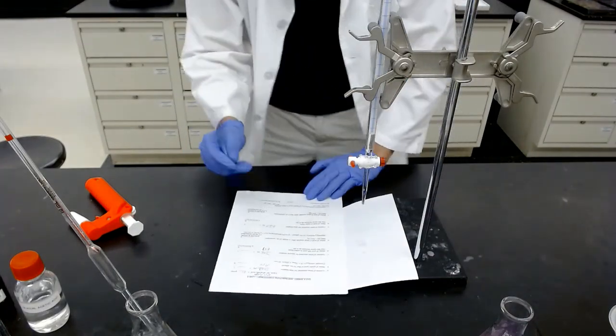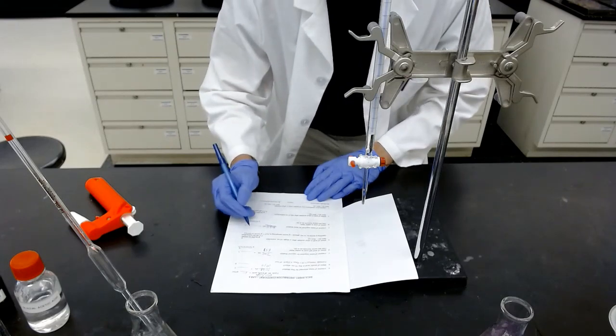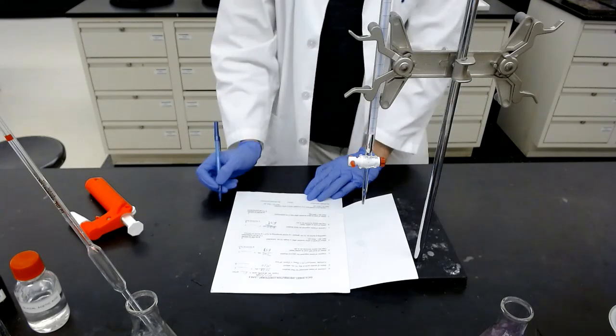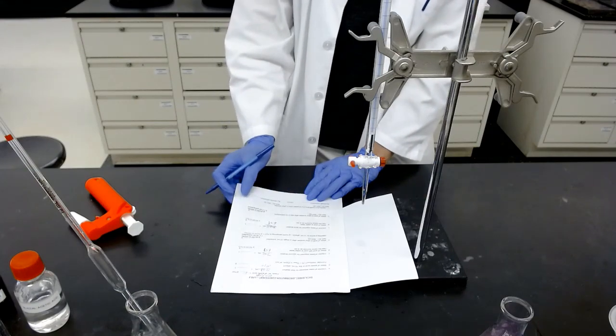So for item F, that's the volume of the base, and I'm reading right now 6.29 mLs. 6.29 mLs for item F.